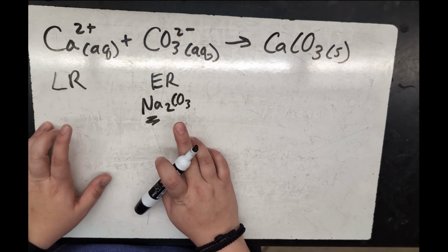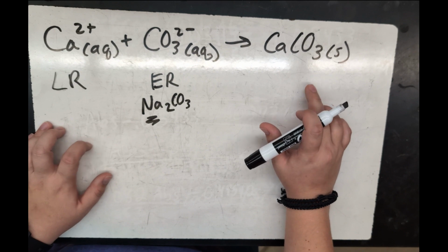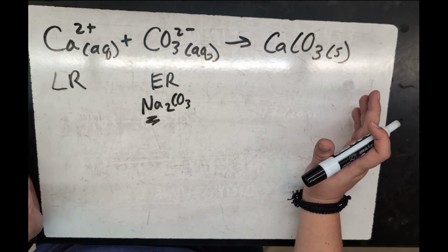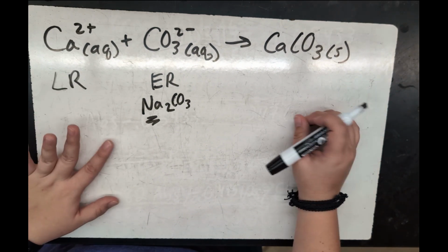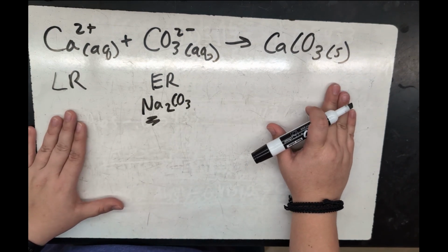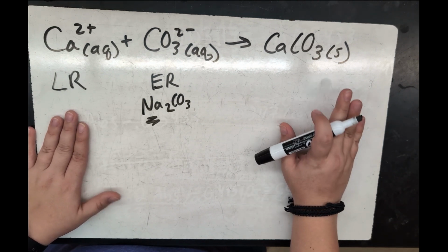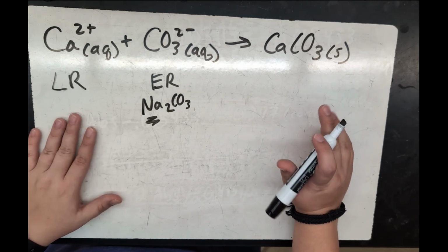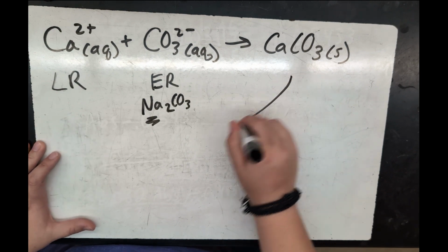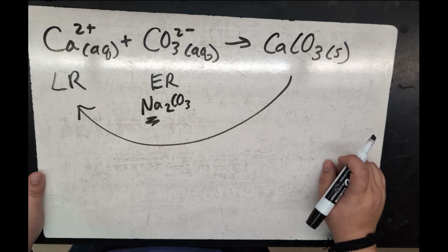Then when they react these two together, they're forming a calcium carbonate precipitate. So this is really their gravimetric analysis experiment for the year, where they are reacting two soluble substances and creating an insoluble product. And then they will filter, wash, and dry the precipitate out to then work backwards to find the amount of calcium ions that were present in the original water sample.